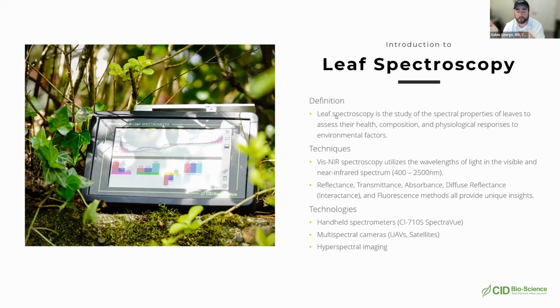Time of day and all of those other things are something that you as the researcher are going to have to determine when you want to collect measurements. If you're using this as a comparison device across different treatments, you want to make sure that you're collecting data under the same kind of conditions. It's not so much how it affects the instrument, it's collecting data that can actually be used in a comparative way. So don't collect data from your control plants at night and then the rest of your experimental groups during the day, that kind of thing. That's where you need to consider those the most.